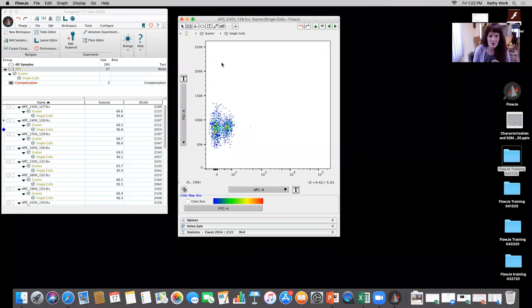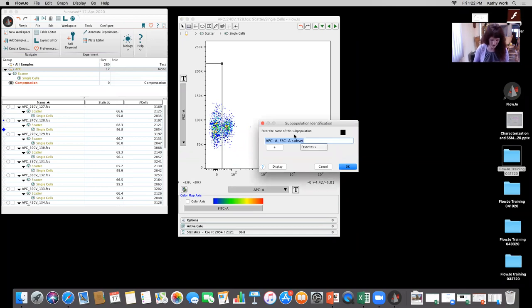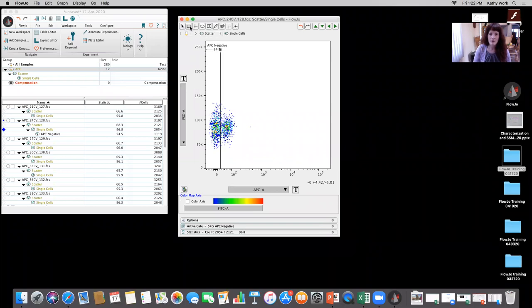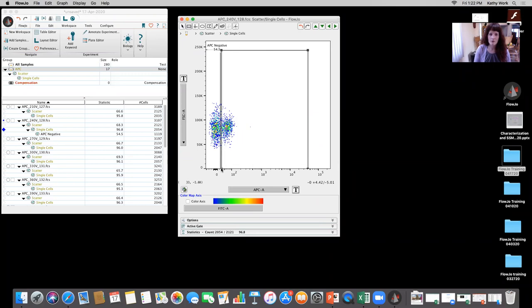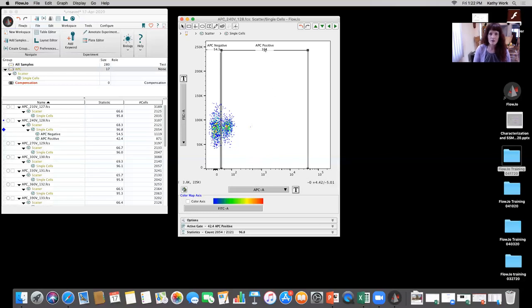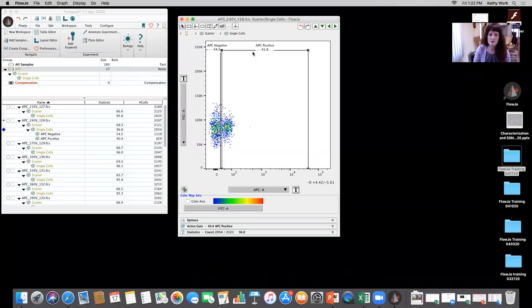I'm going to use forward scatter versus APC and use a rectangular gate for APC negative, then create another rectangular gate for APC positive. Sometimes it gets a little buggy — you saw the number was 151 but as soon as I made a minor adjustment it changed back to a percentage.